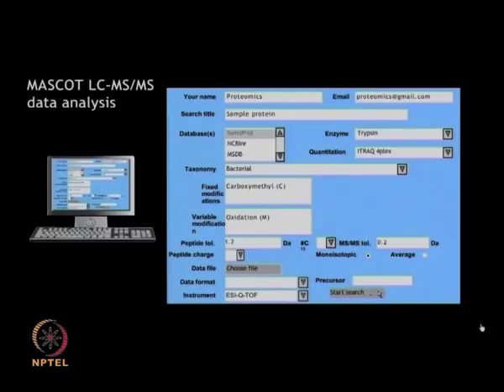The data file generated from the MS is uploaded and the search can be carried out.